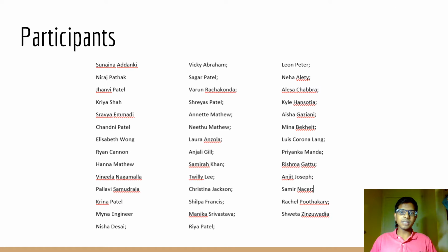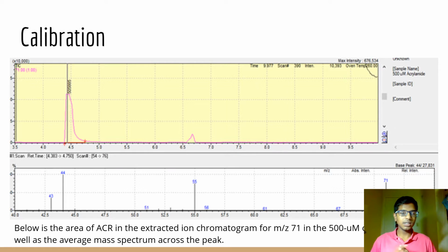So now, in our specific experiment for determining the amounts of acrylamide in NSU college students' diets, we had all these participants consent to providing food samples and filling out survey results. Next, this is calibration data which we use to compare the food samples against the known samples.